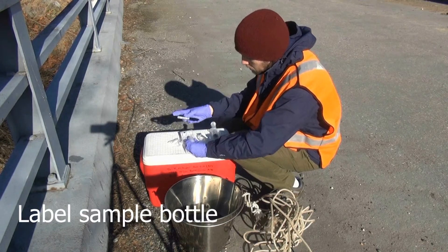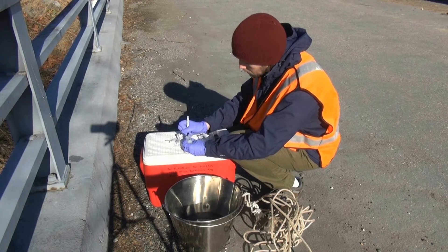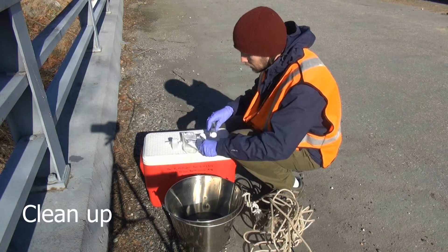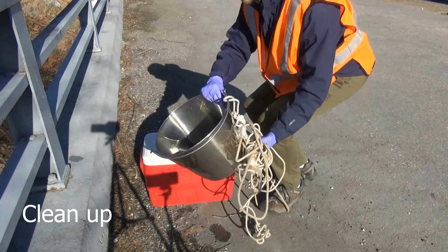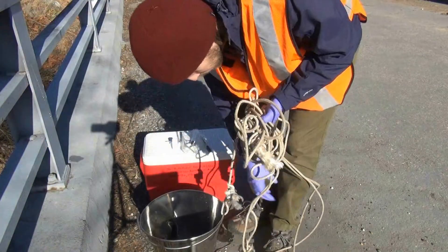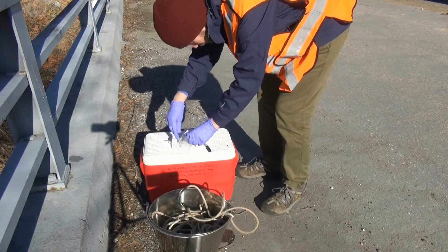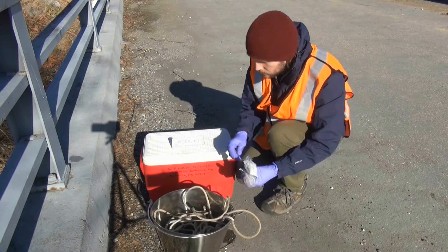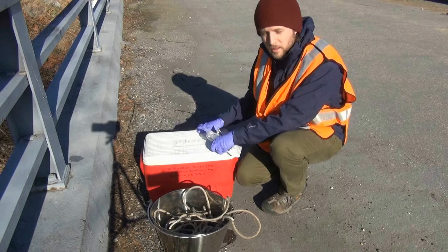Label the sample with the collection site and date. Empty any remaining water from your syringe and dump out the bucket. Pack up your trash. Place the sample in a cooler with bagged ice or ice packs for transport back to the lab.